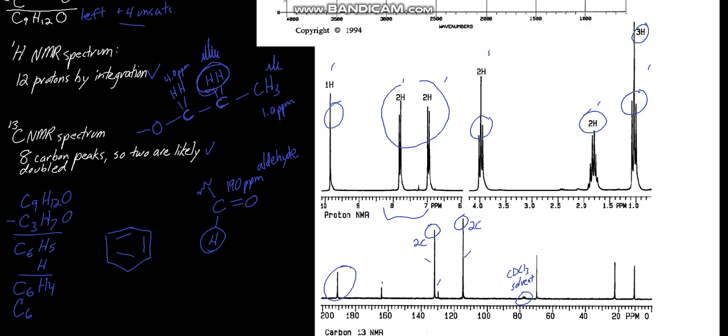So yes, the carbon and the proton are in agreement. If you're on the right track, everything agrees. You're not force-fitting any kind of single piece of data in any way, stretching it in any way to make it fit. We're deriving the structure from the data, not fitting structures to the data.